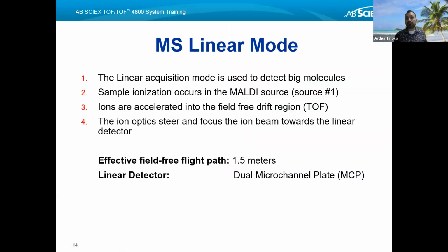And so here's just a summary of this information. Linear acquisition mode is for the big molecules. Essentially, your ions are accelerated into the field-free drift region, the time of flight. The ion optics steer and focus the ion beams toward the linear detector.